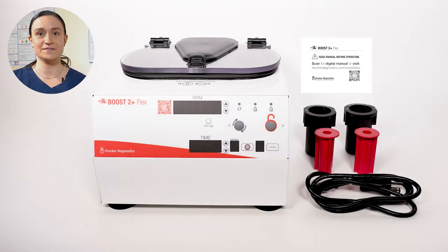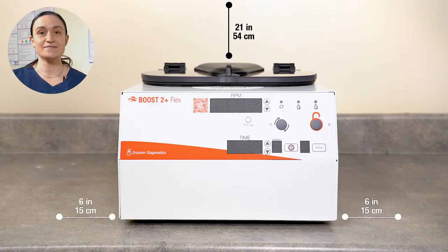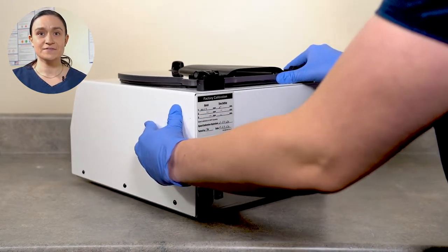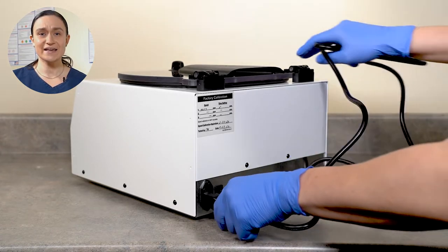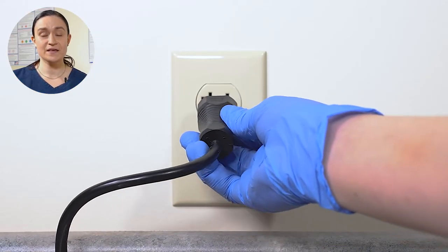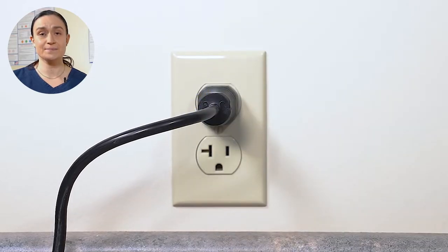These inserts sit inside the buckets and can be used to spin a variety of different tube sizes. Once you've confirmed that all of your accessories are present, it's time to get the Boost 2 Plus Flex set up. Start by finding a flat, level surface. You will need at least 6 inches or 15 cm of clearance on all sides of the centrifuge, and at least 21 inches or 54 cm of clearance at the top so you can open the lid. Once placed, turn the centrifuge around to look at the back, plug the power cord into the back, then plug the other end into a wall outlet. Make sure that wall outlet is easily accessible, as you will need to unplug your Boost 2 Plus Flex for any cleaning.